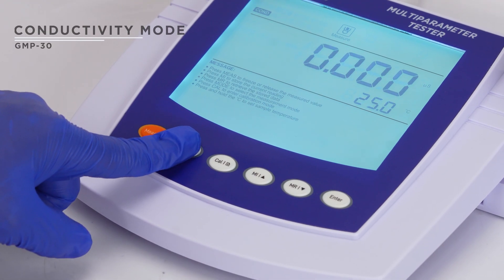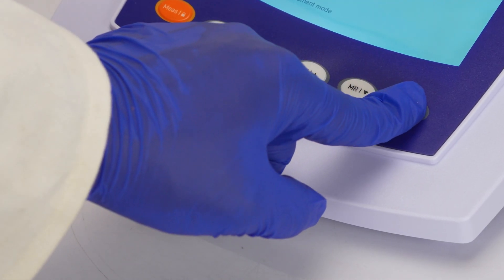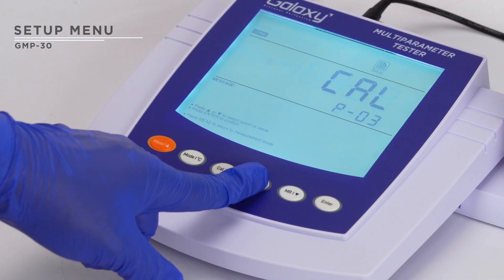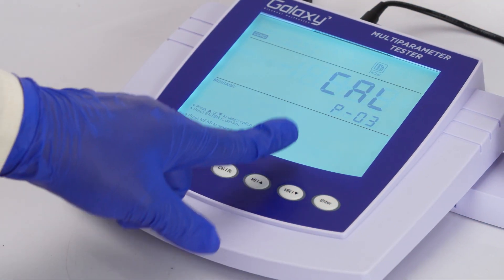To switch to conductivity mode, use the mode option. Once selected, press enter to save your changes. Long press the cal key to adjust settings such as the cell constant and calibration points. Press the cal key to start calibration with three standard buffer solutions.